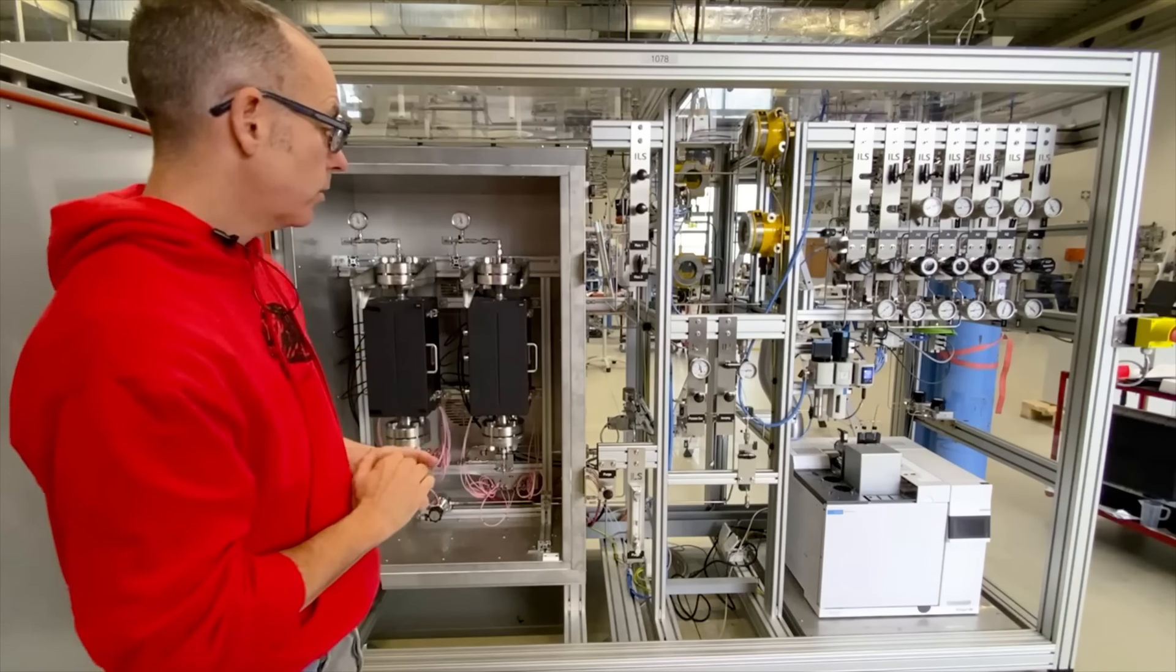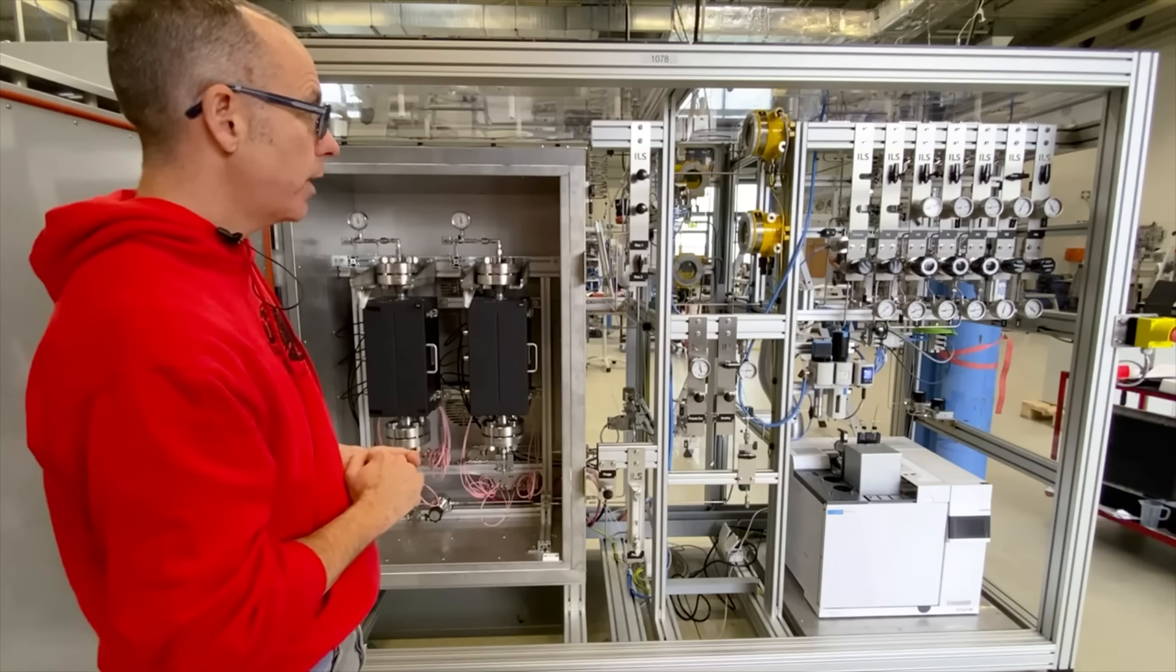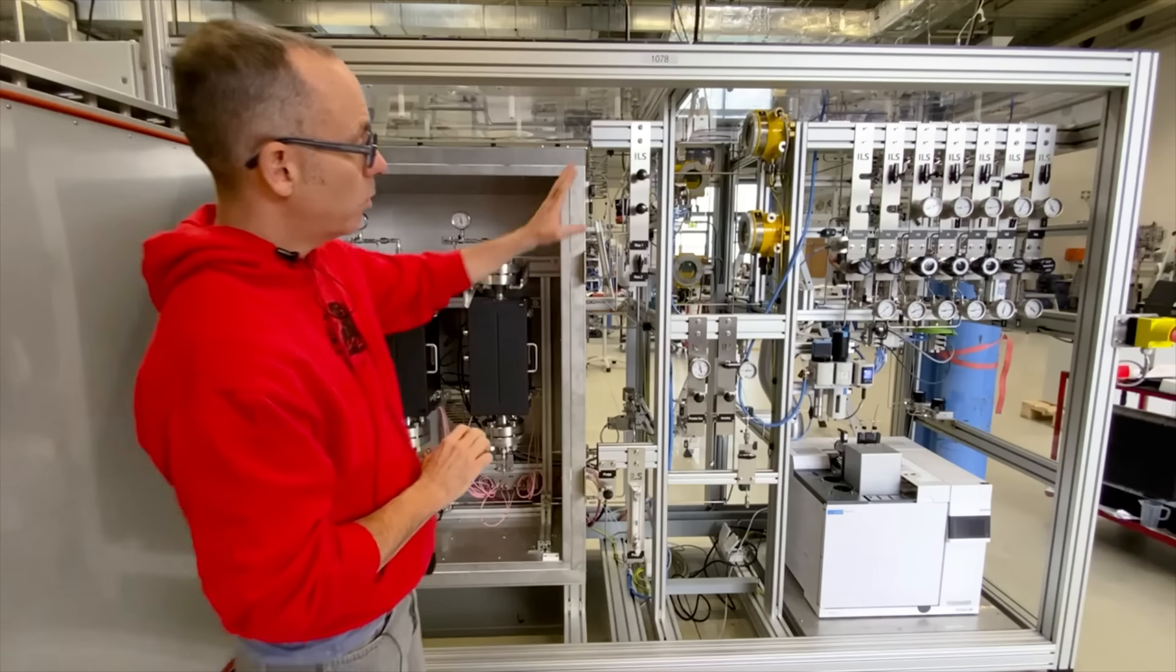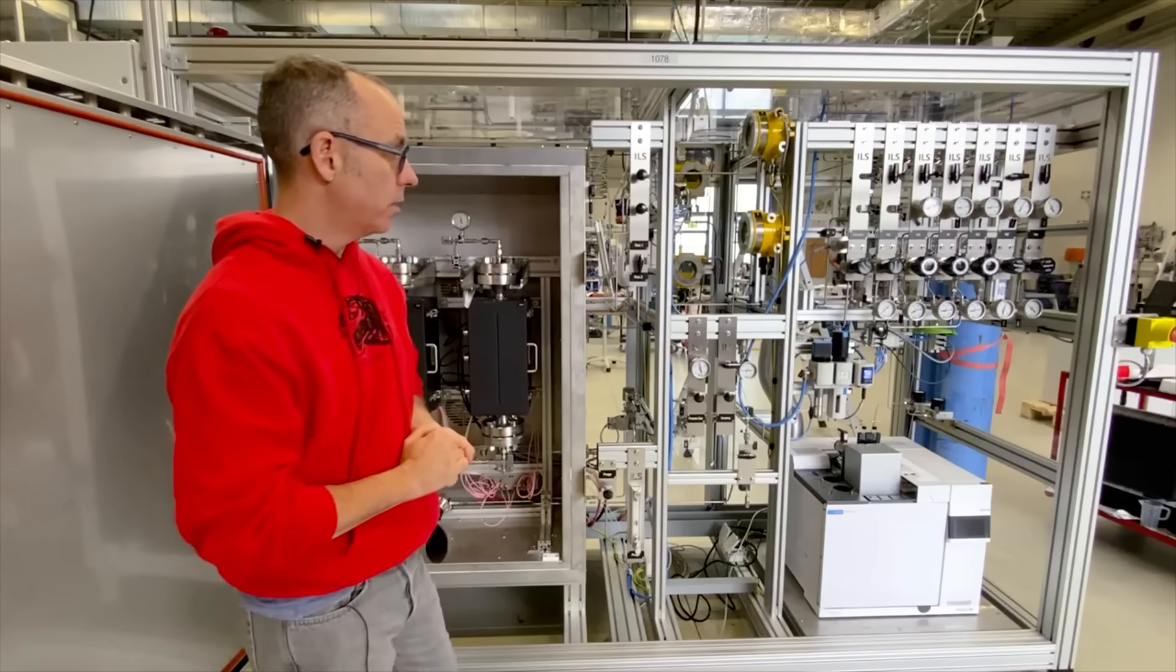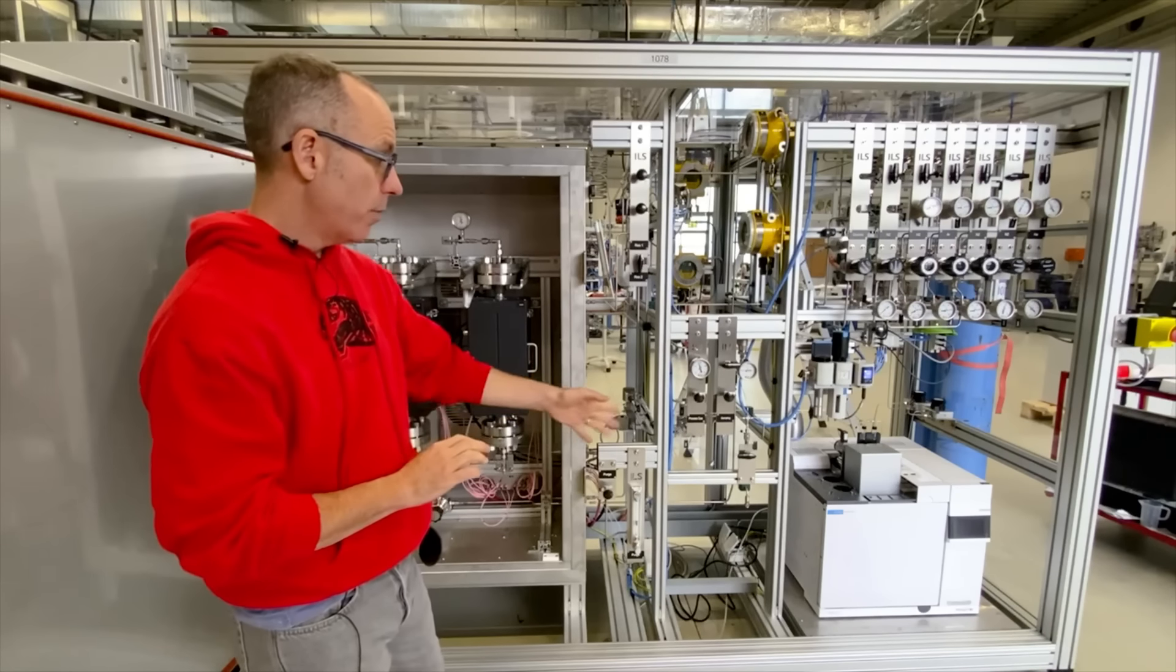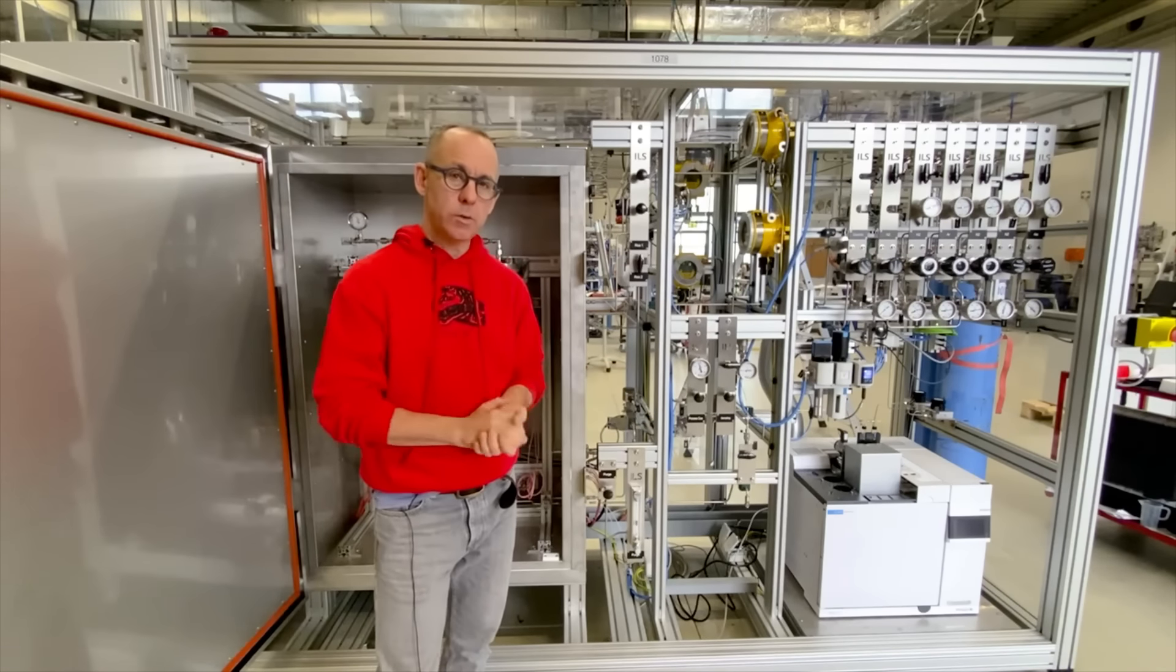The unit has the complete gas dosing section integrated. We have all of the ammonia and hydrogen gas detectors needed for safety's sake and we have an online GC which can measure all of our products continuously.